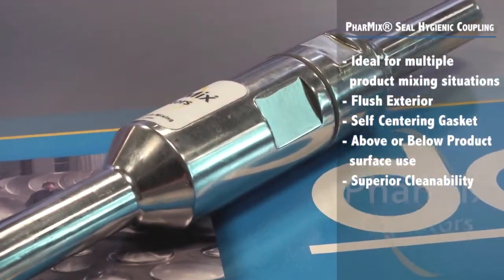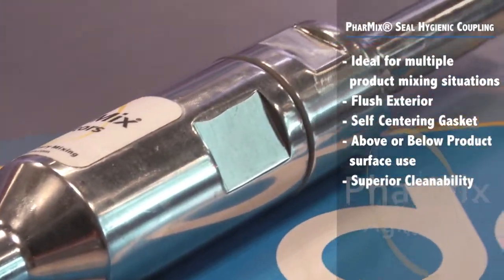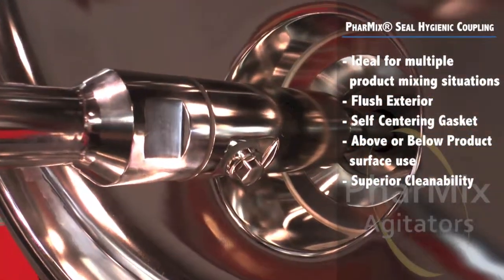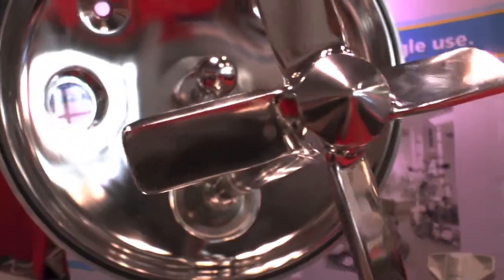The hygienic coupling also features a self-centering tough steel gasket which ensures quick and easy installation, and the gasket will not extrude like standard o-rings. The uniquely designed Pharmix seal hygienic coupling can be used above or below product surface and accommodates frequent equipment inspections and superior cleanability.